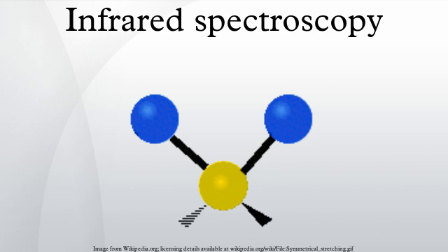The infrared portion of the electromagnetic spectrum is usually divided into three regions: the near, mid and far infrared, named for their relation to the visible spectrum. The higher energy near IR, approximately 14,000 to 4,000 cm⁻¹, can excite overtone or harmonic vibrations. The mid-infrared, approximately 4,000 to 400 cm⁻¹, may be used to study the fundamental vibrations and associated rotational-vibrational structure.